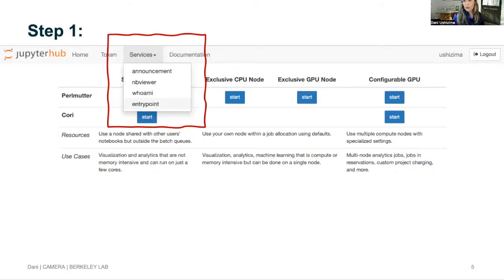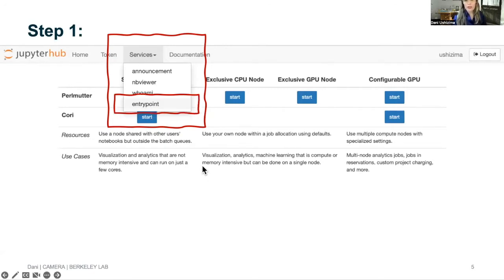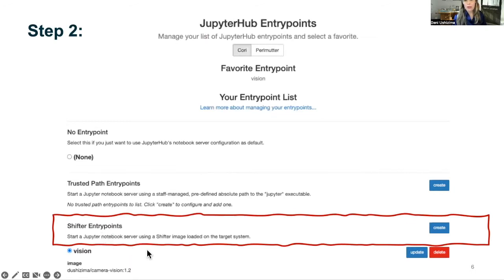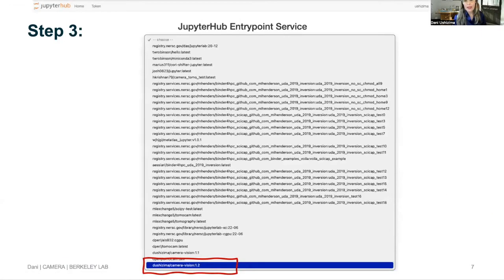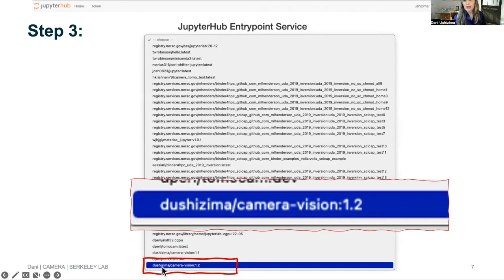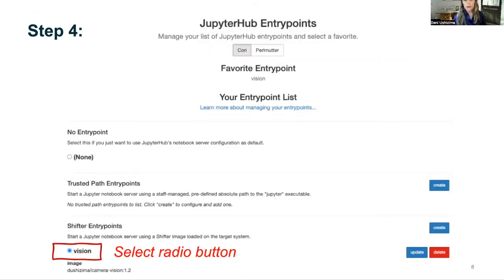For those that are going to be running this on NERSC, first go to Services, select Entry Point. You might have done this before, but now you're going to select a different one. You're going to need to create yet again, and then there'll be a dropdown. It's the last one on the list as of right now: the Ushizima Camera Vision 1.2. You go back to the other page, select it — I named it Vision — and whatever you named your entry point, that corresponds to the Ushizima Camera Vision 1.2. Select that and voila.